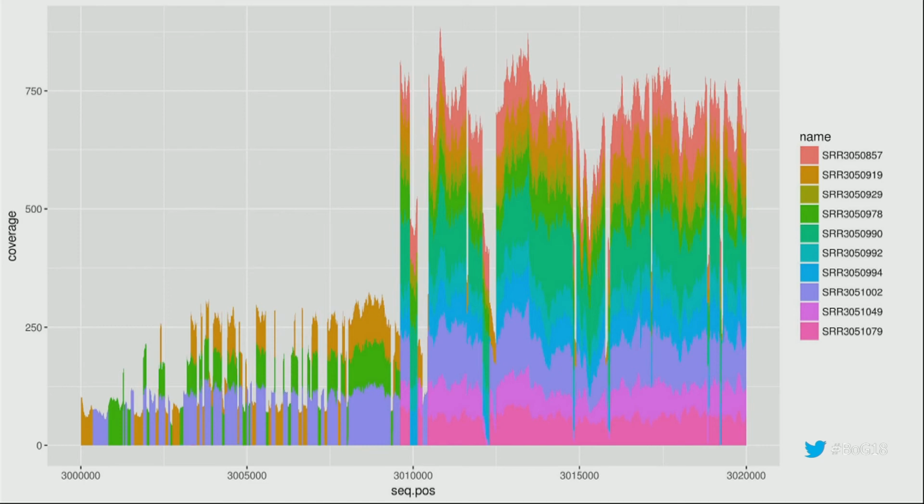And this is just a tiny fraction of the whole set. I've linearized it, so we made a sort that linearizes the graph. And here we look at 20 KB, and you can see there's this portion here that's shared among most of the samples. And then there's this region here that's shared among 3. And in fact, it's more sparse. There's actually strain-specific components in it.